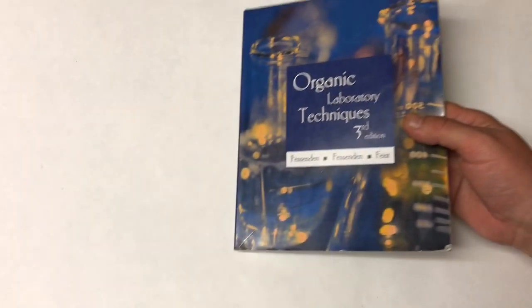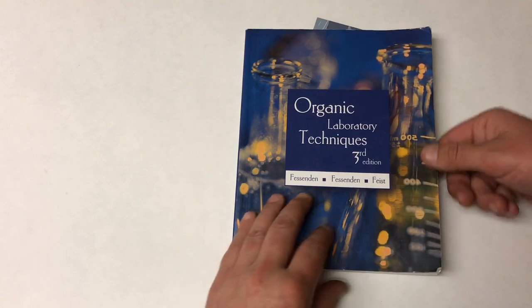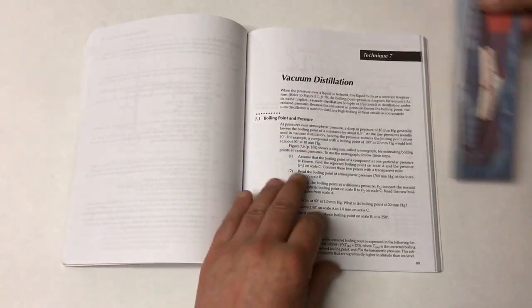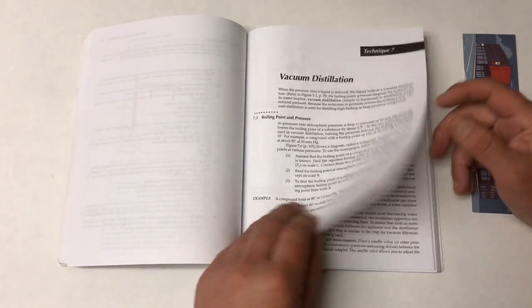This is a great book that I picked up at Powell's bookstore, Organic Laboratory Techniques, and here in chapter 7 it talks about vacuum distillation.